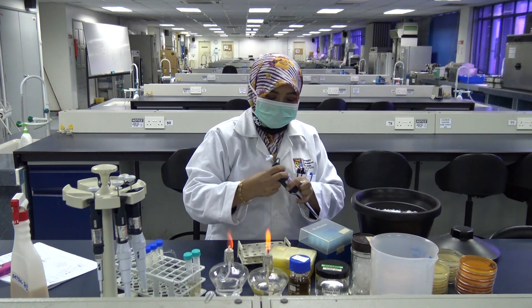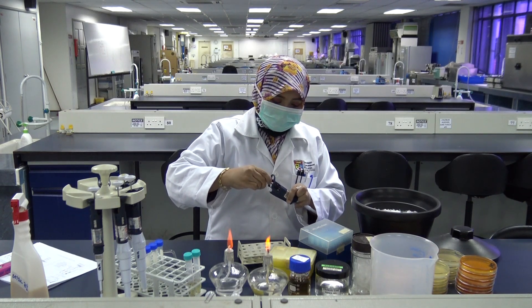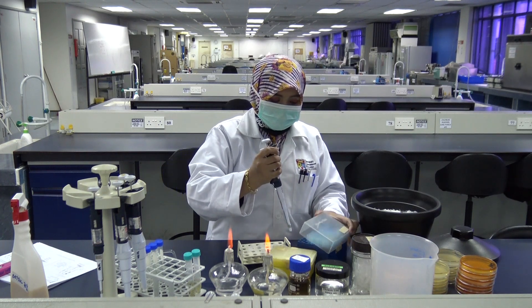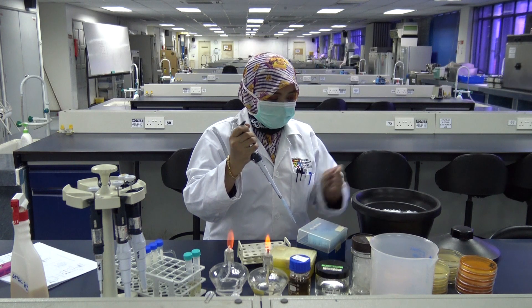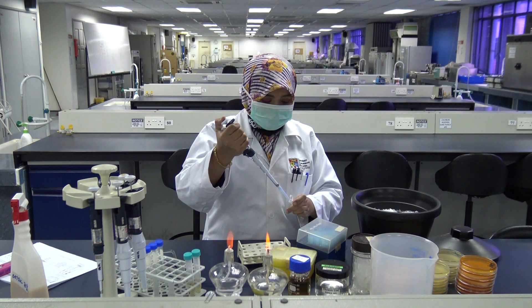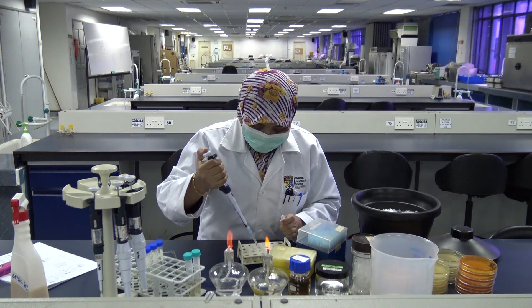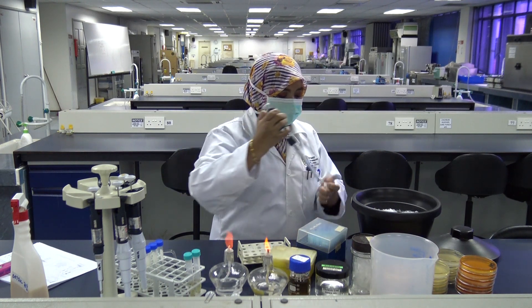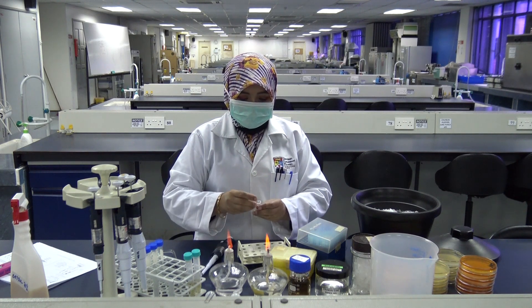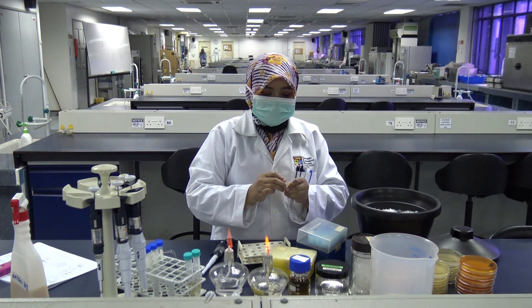Then reset your micropipet to 800 microliters and transfer your recipient cells into the same Eppendorf tube.